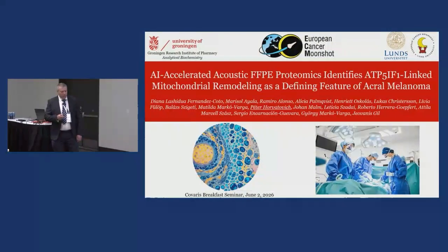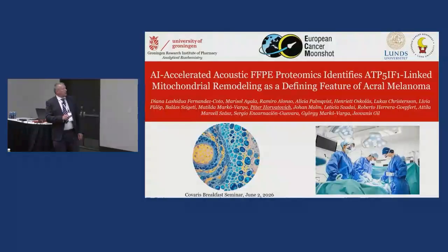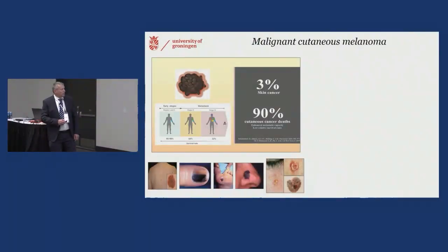The work I will present is about how we have used the Covaris accelerated acoustic sample preparation for FFPE sample preparation for untargeted proteomics, and I will speak about some of the findings based on the data generated with this workflow.